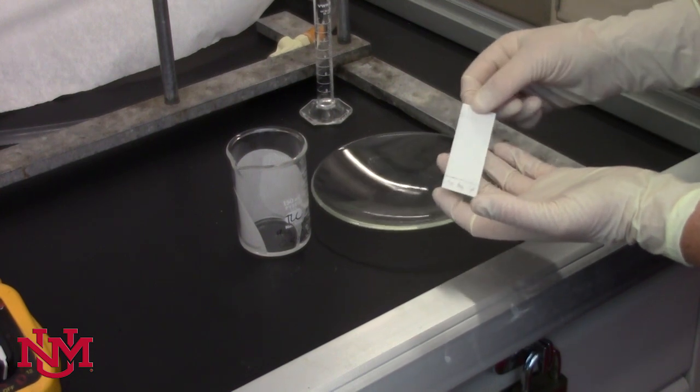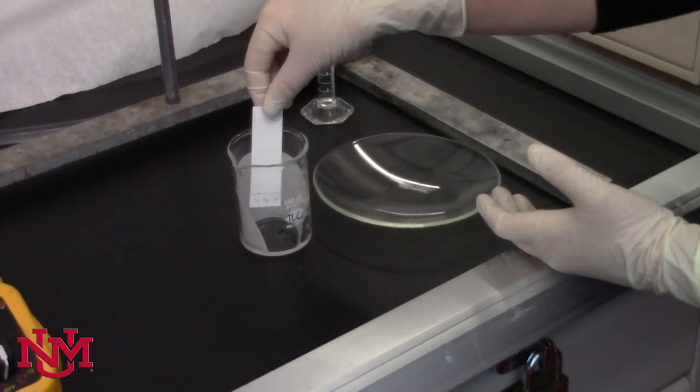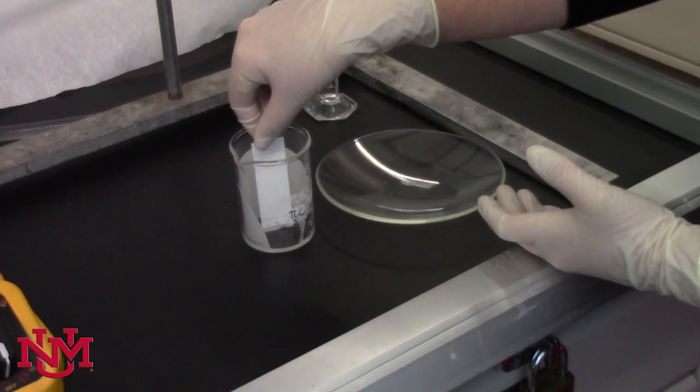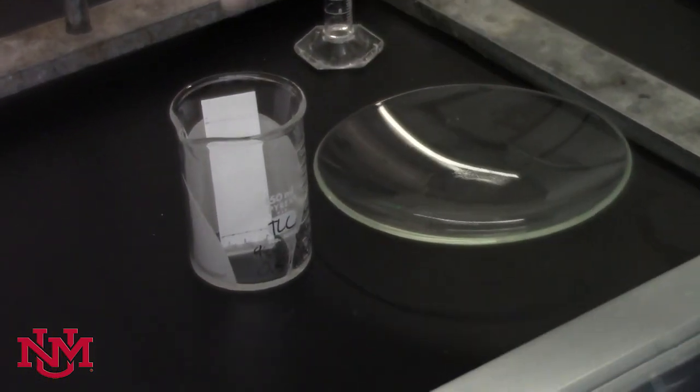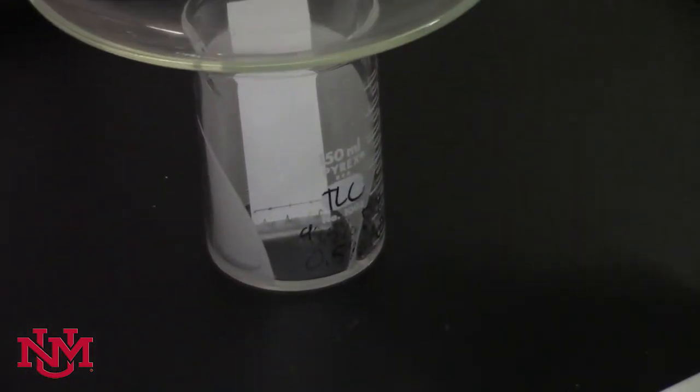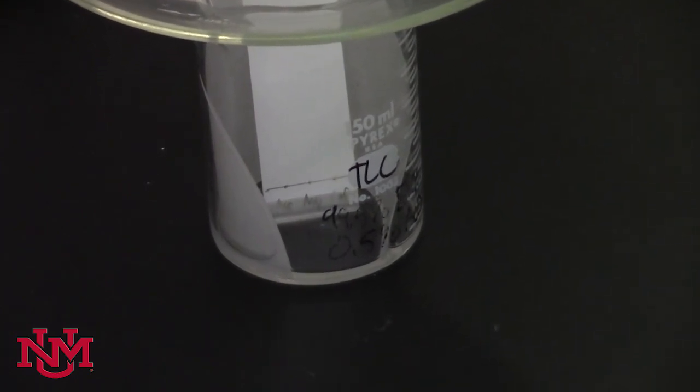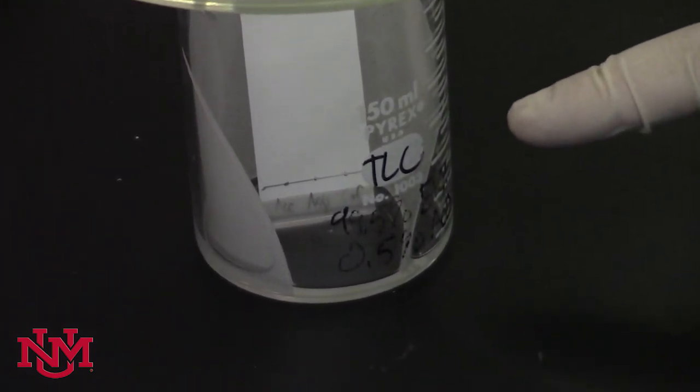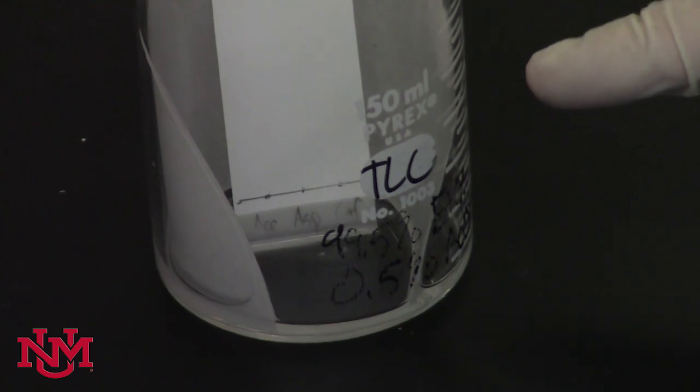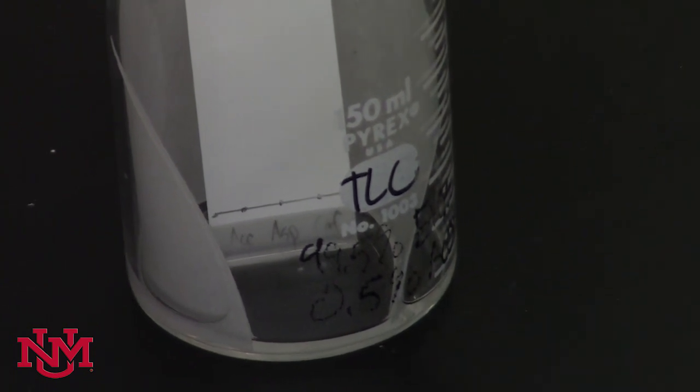Remove the lid and drop the TLC plate into the chamber, keeping it upright and resting it against the side of the beaker. Replace the lid and wait until your solvent, as you can see creeping up the TLC plate, has reached your top line that you marked.